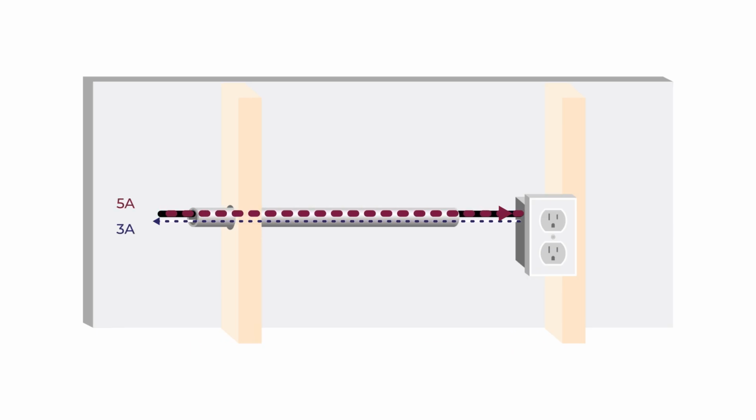And so with these wirings, the electricians or whoever put in the wiring could have taken shortcuts or not done things exactly as you should, resulting in net current. And as we just discussed, net current is really problematic, and this can result in serious magnetic field issues for your lab.